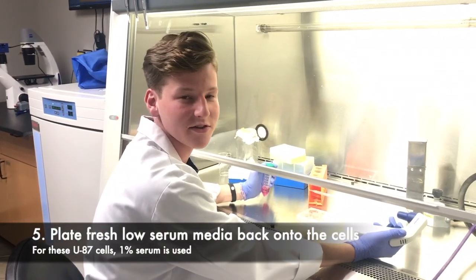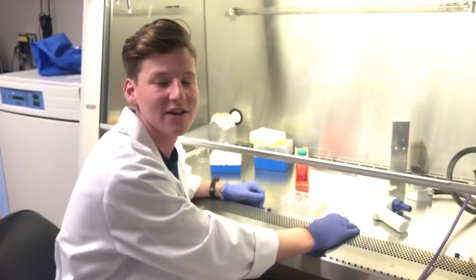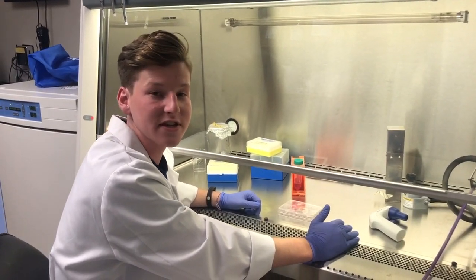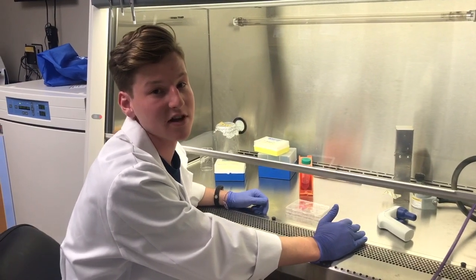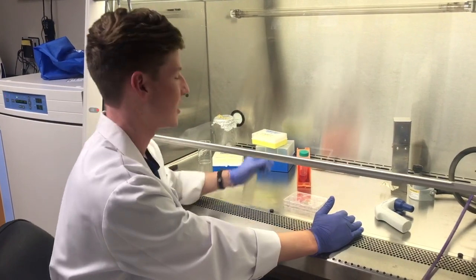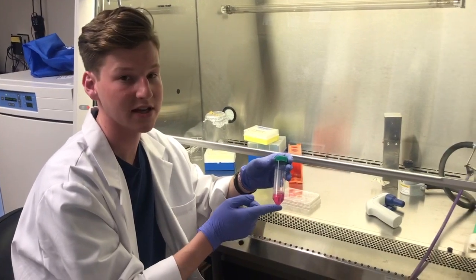Now that you've aspirated off all the normal serum media, we're going to replace it with low serum media. The reason we use low serum media is that in a scratch assay you're trying to measure cell migration, but with normal serum levels you could also be measuring cell proliferation. By reducing the serum, you eliminate that variable so you can be sure you're only measuring cell migration.